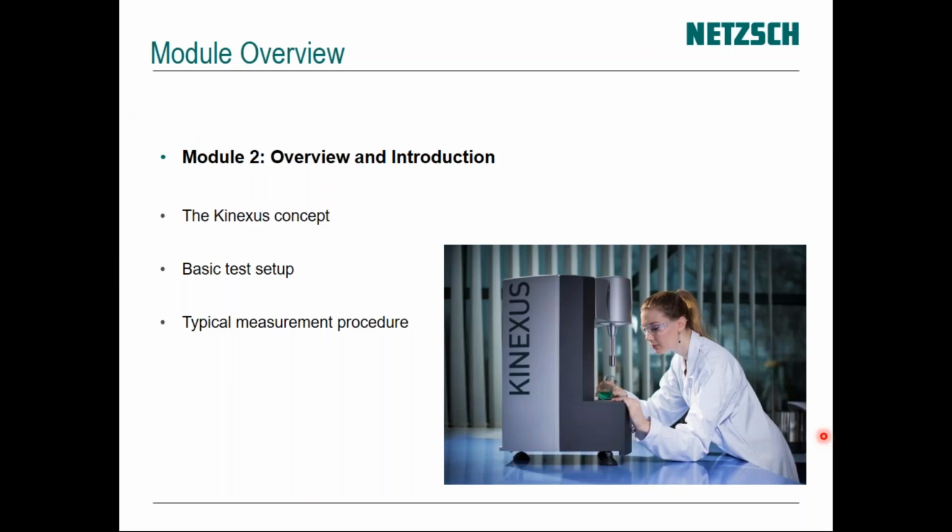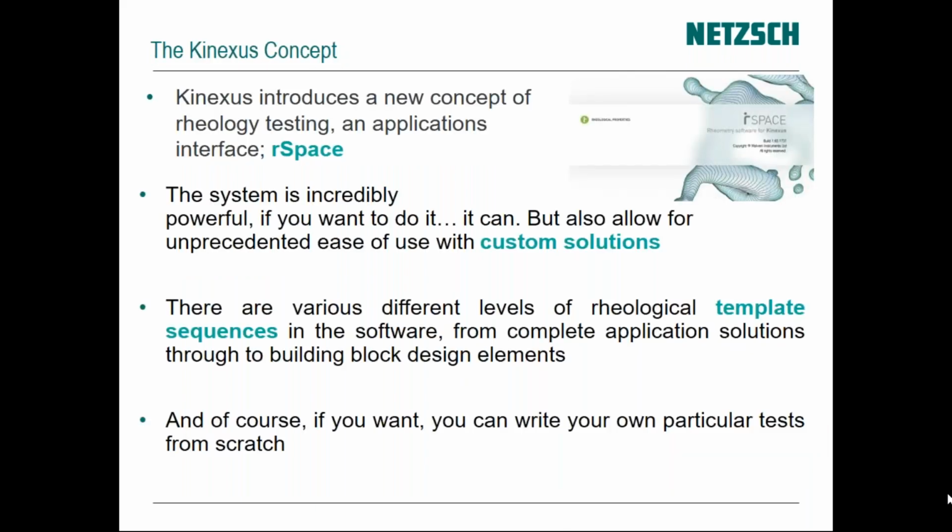In this module, we're going to go through the Kinexus concept of the software, and then basic test setup, and then the typical measurement procedure. This is actually a fairly easy to use instrument, so you'll hopefully see that with the training today.